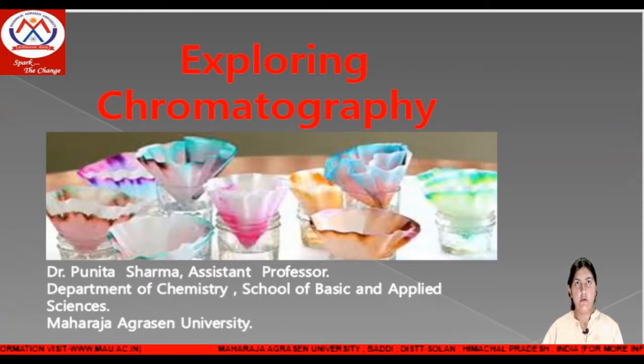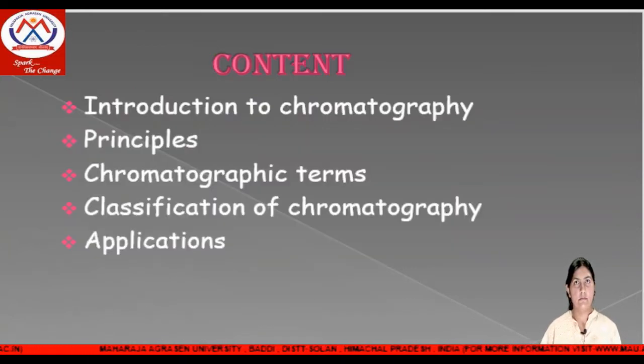The name of the topic is Exploring Chromatography. The content we cover in today's topic is the introduction to chromatography, principle, chromatographic terms, classification of chromatography and applications.